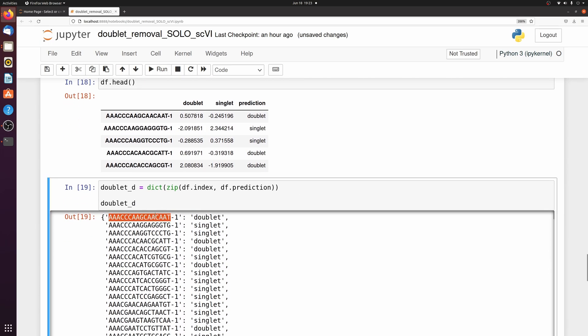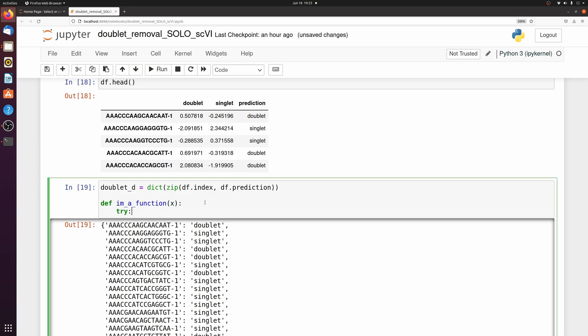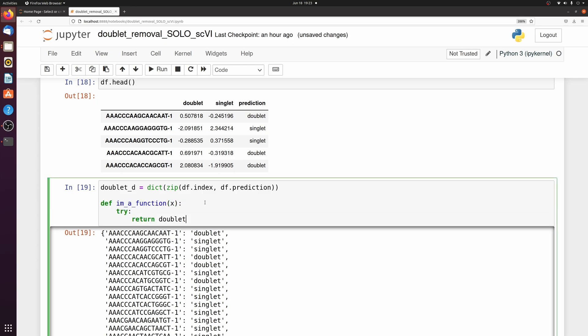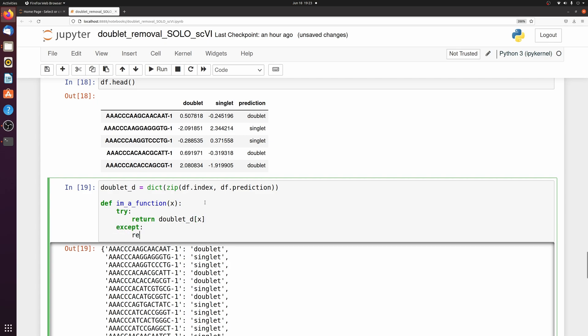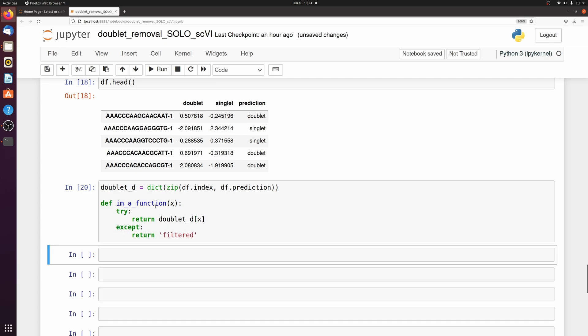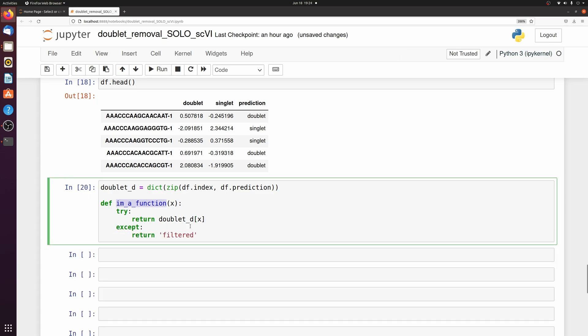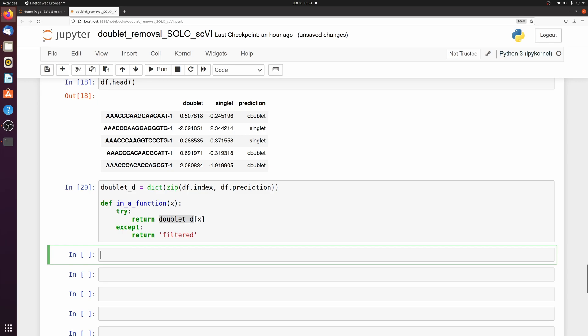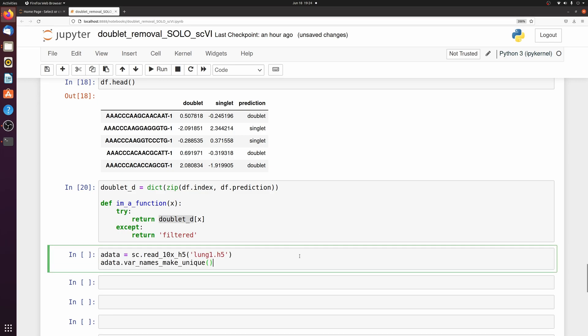So again, I just have a dictionary of the cell barcode and then if it's a doublet or singlet. And then I made a little function because the original data hasn't been filtered, so you're going to get some errors if the barcode isn't in the dictionary. So let's just reload that adata from earlier. I'm just going to go ahead and copy and paste it from what we did above.